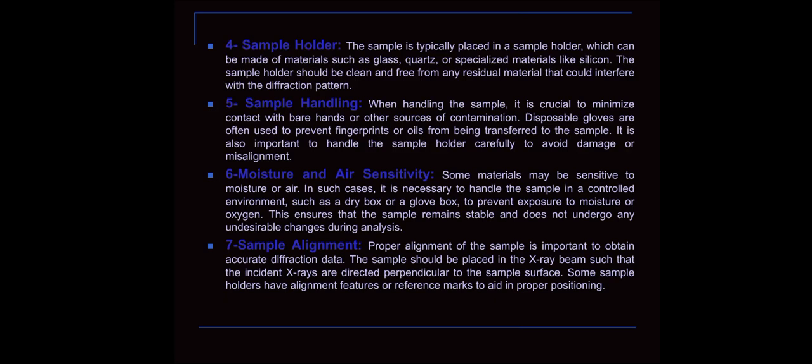Fifth, sample handling. When handling the sample, it is critical to minimize contact with bare hands or other sources of contamination. Disposable gloves are often used to prevent fingerprints or oils from being transferred to the sample. It is also important to handle the sample holder carefully to avoid damage or misalignment.